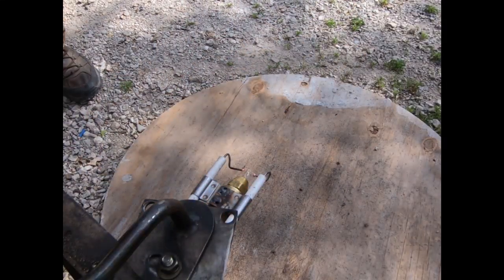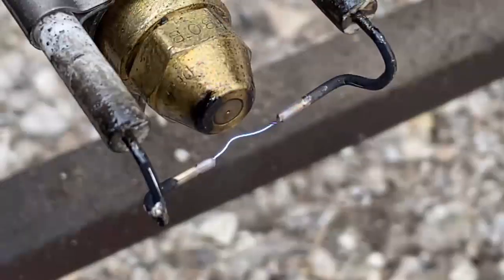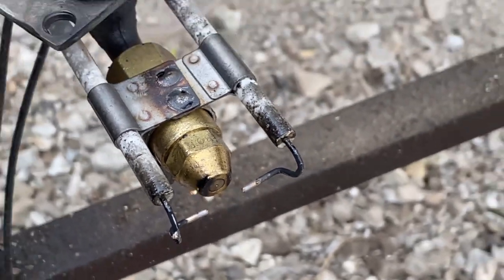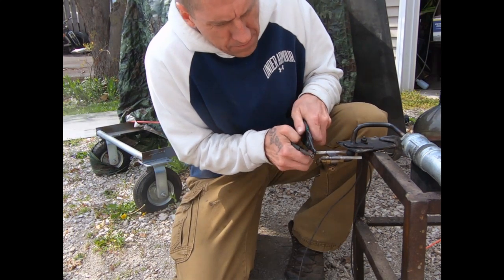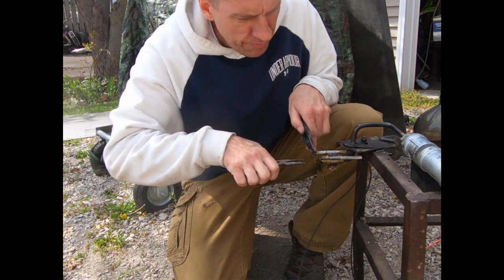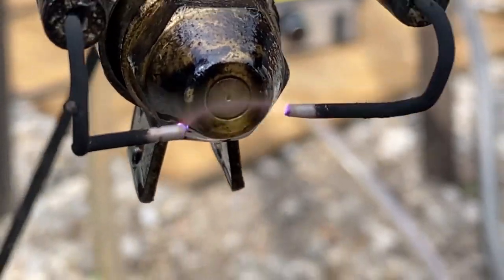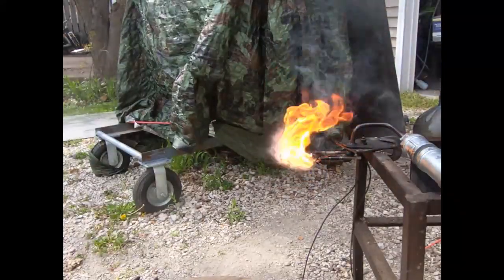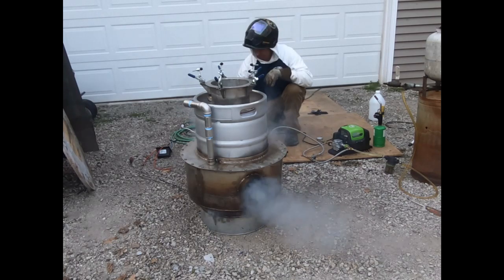So how do we solve the explosion problem on ignition? This is a standard ignition system for a liquid combustion burner — I thought, why not just do what they do on those? A spark plug won't cut it with liquid fuel operation and I don't want to be using any propane. I had to do this naked test to make sure the electrodes were not in the fuel stream path, which would cause reliability issues. I want a novice to be able to safely walk up to this thing without wearing a welding helmet.